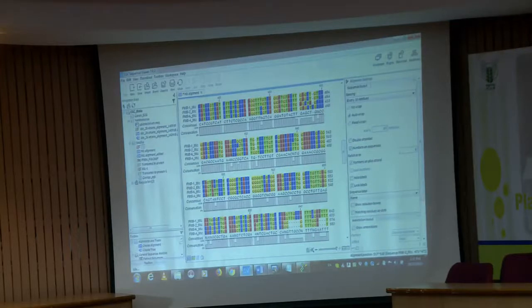So, first was the Contig formation and now this is the editing of your sequence, correct. So, this is the example which I am showing you how you can change the base if the quality of that particular base is not good in one read, but it is good in another, then you can replace it. But if this G is actually G in both forward and reverse, then you do not have to change it.